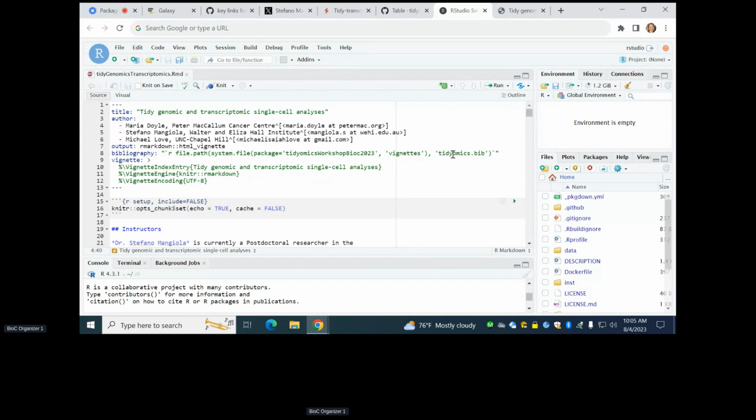Okay, so maybe let me ask, who is familiar with tidyverse and uses it day by day? Okay, virtually everybody. Who has ever worked with any of the tidy adapters in Bioconductor, tidyTranscriptomics, tidySummarizedExperiment or the plyranges or others?